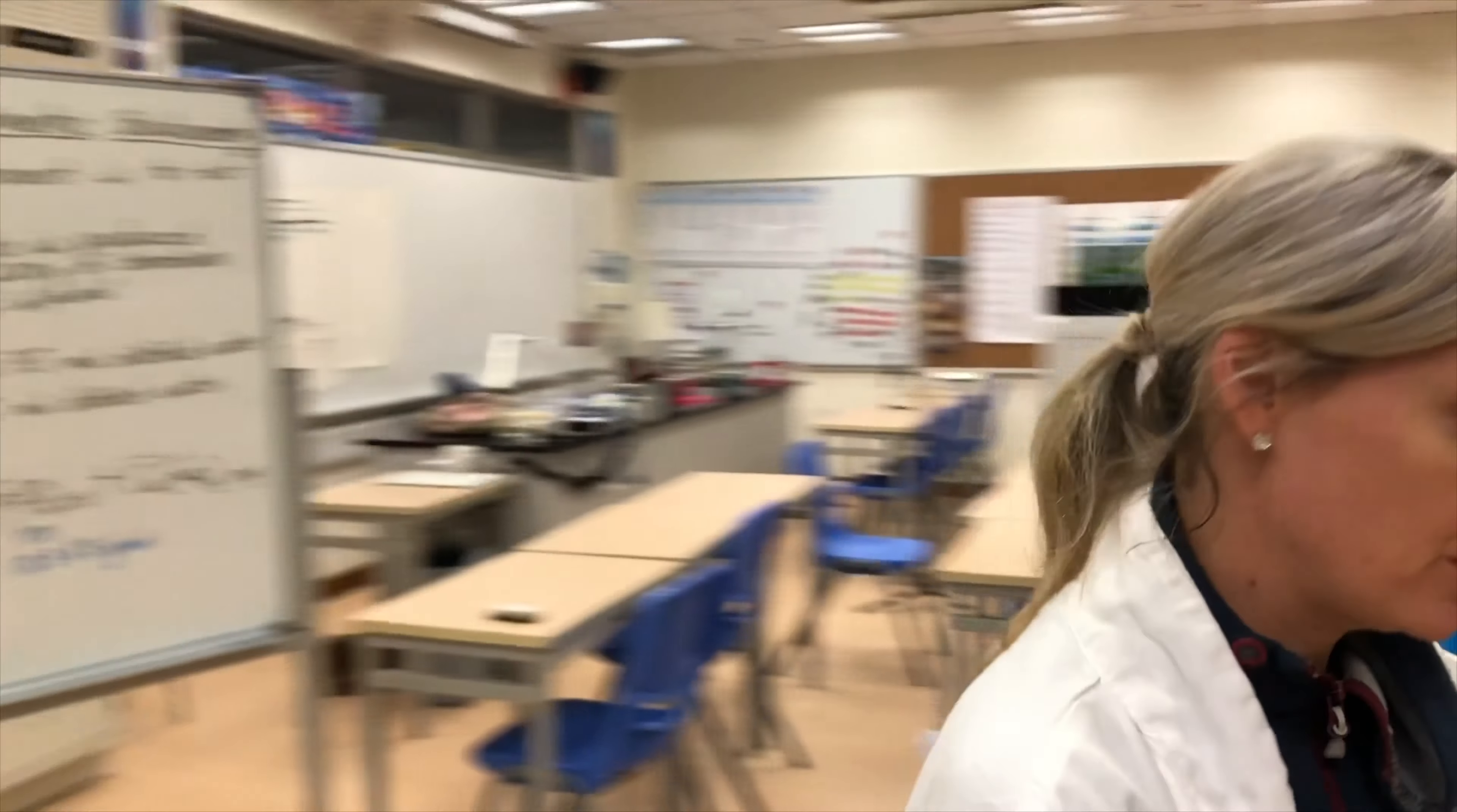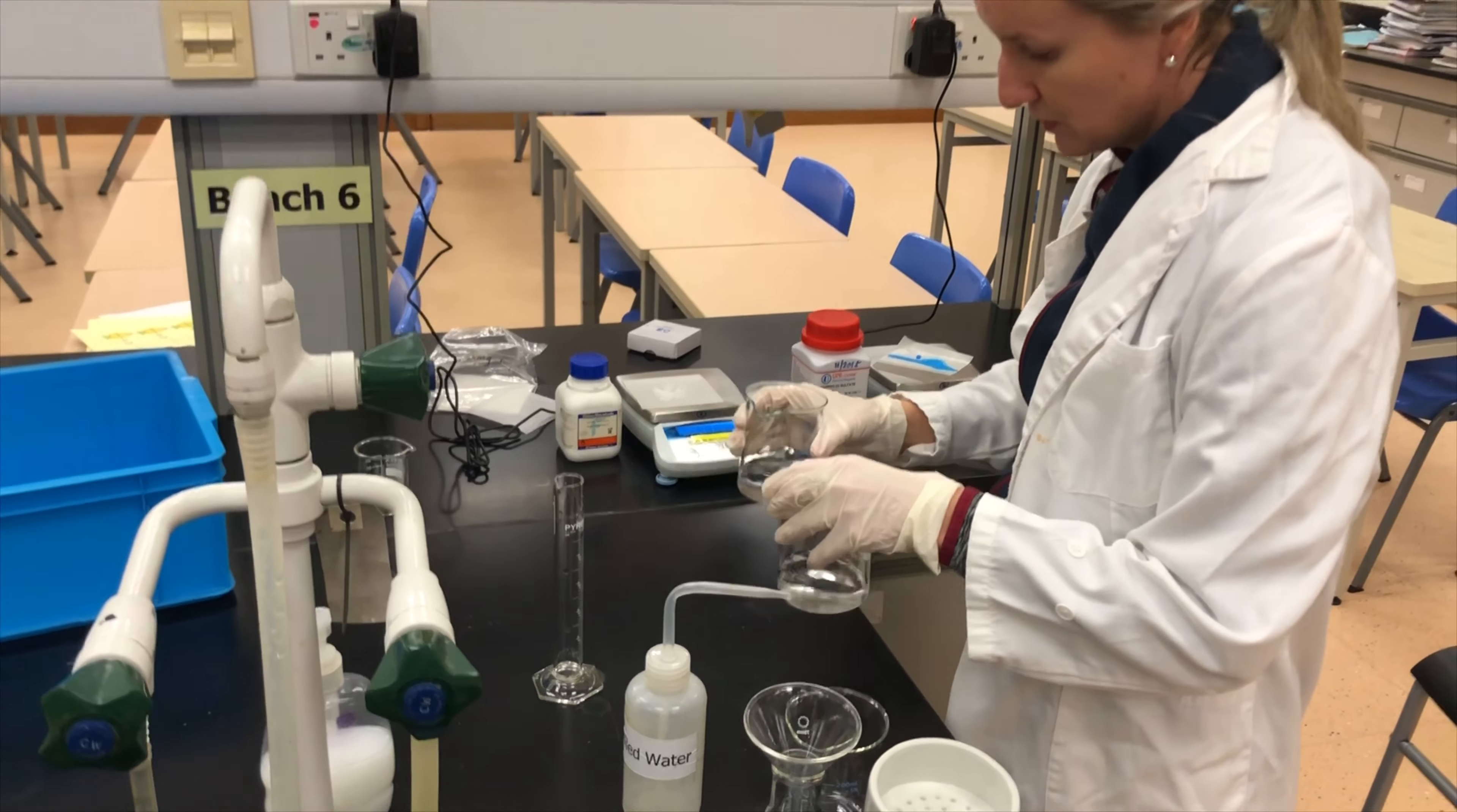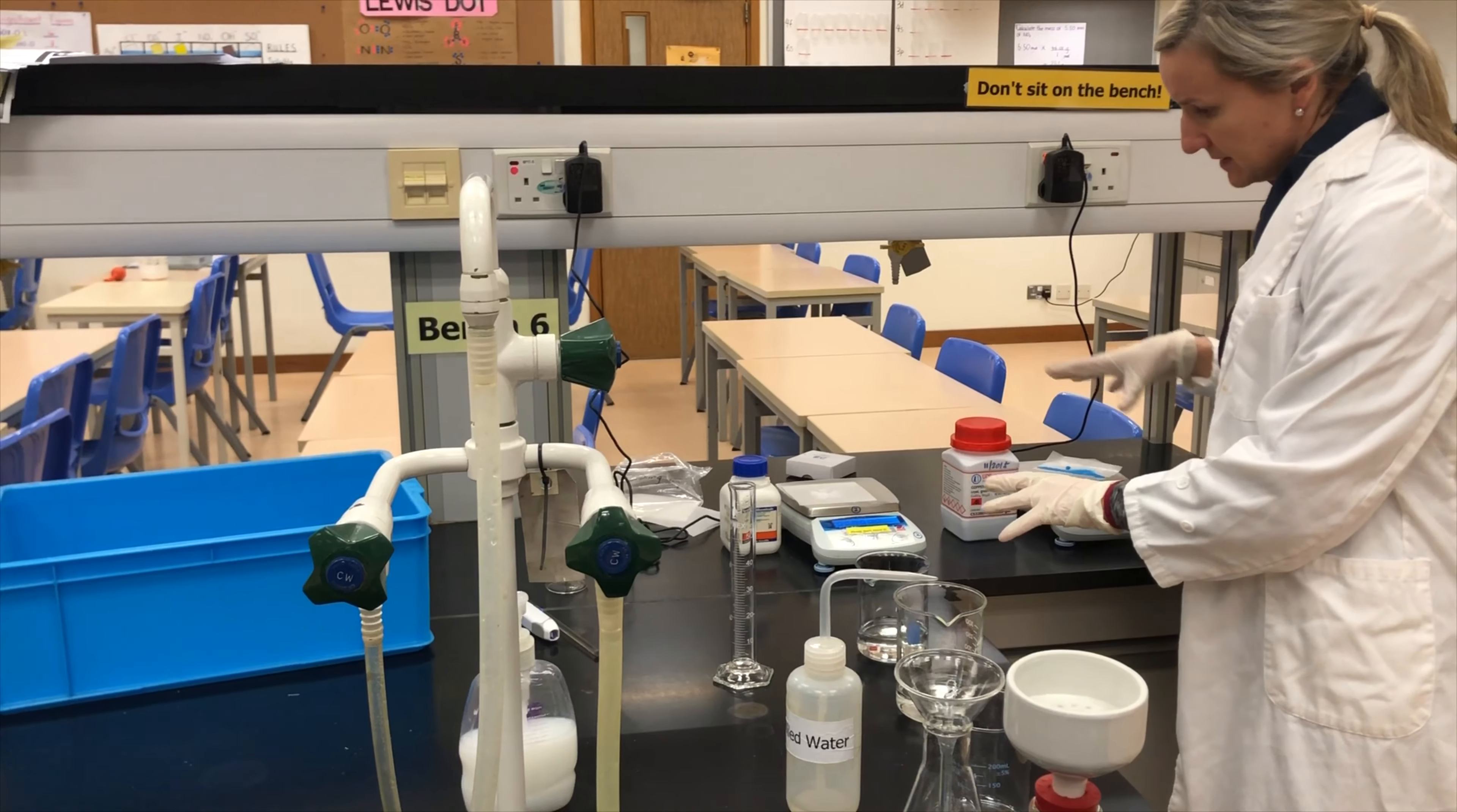So I'm just going to move down to where I've already weighed out our amount of the solid. You can see this is my two beakers where I've used my measuring cylinder to put my 75 ml of distilled water in. I've already done that. I've already weighed this out.